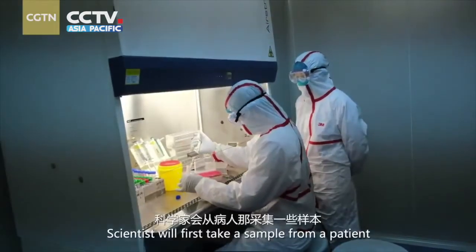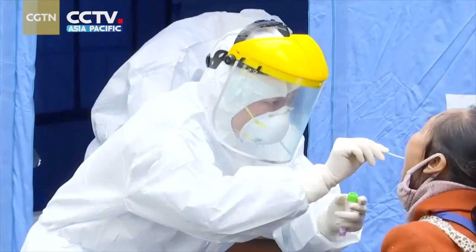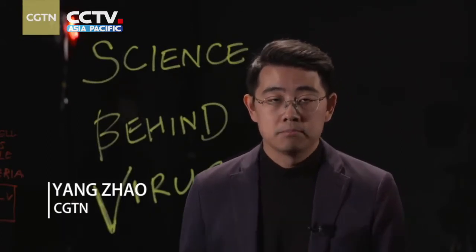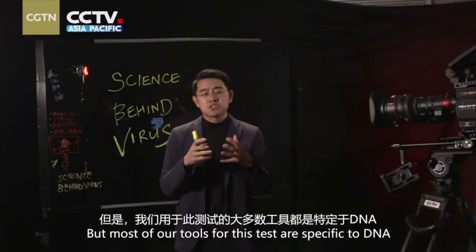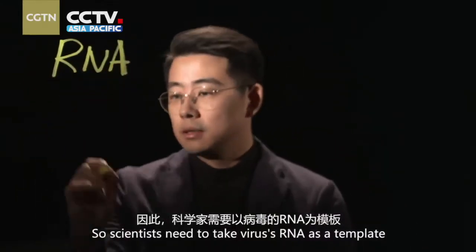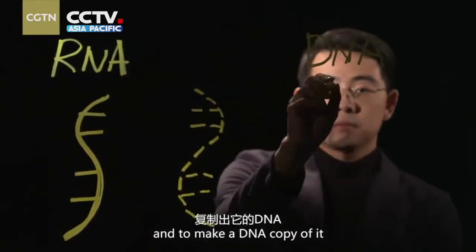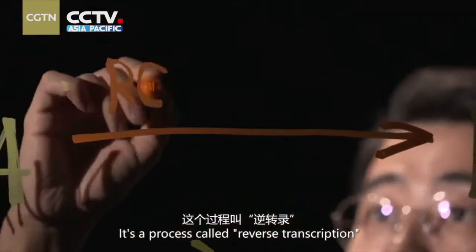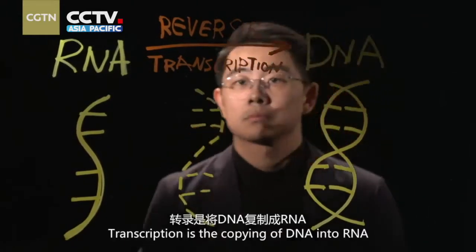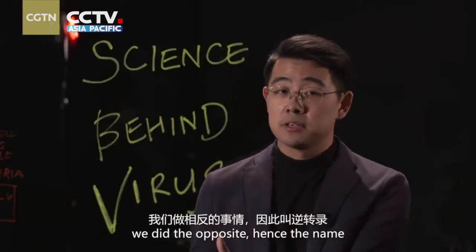Scientists will first take a sample from a patient, usually a throat swab, to test for coronavirus. The genetic material of this new coronavirus is RNA, but most of our tools for this test are specific to DNA. So scientists need to take virus RNA as the template, create a complementary strand, and make a DNA copy of it. This process is called reverse transcription.